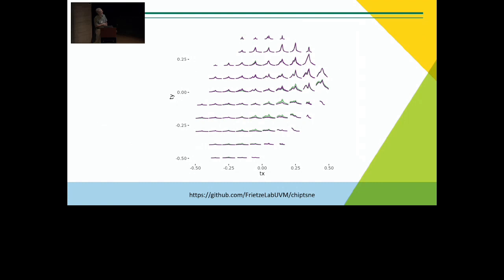The main thing going on in this tsne space is high enrichment on this side, low enrichment on this side, but you can see these subtle differences in peak shape here. There's double peaks and things like that. But then you also see differences between the two conditions where here green is higher and there's a little space here where the purple is higher.